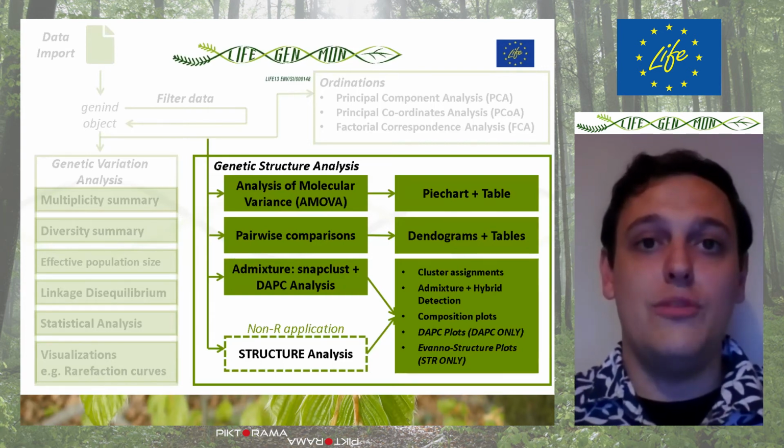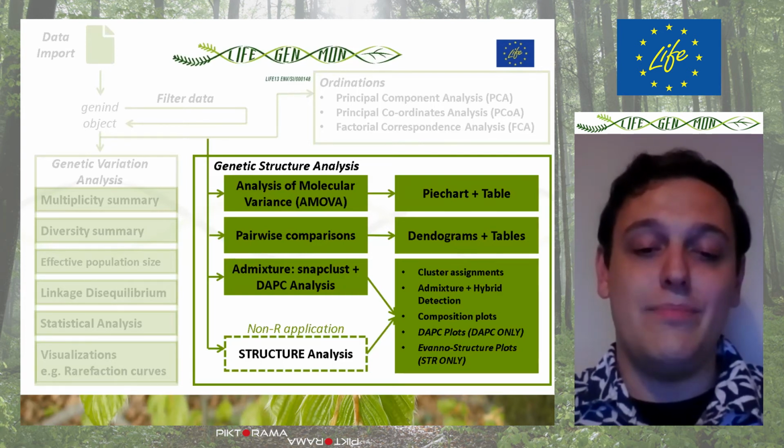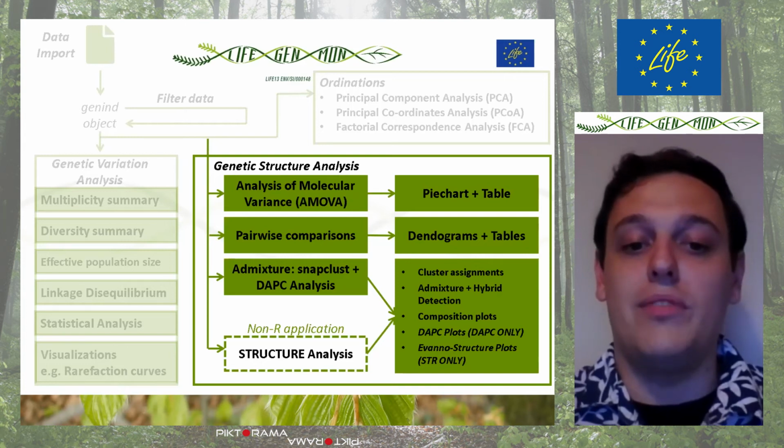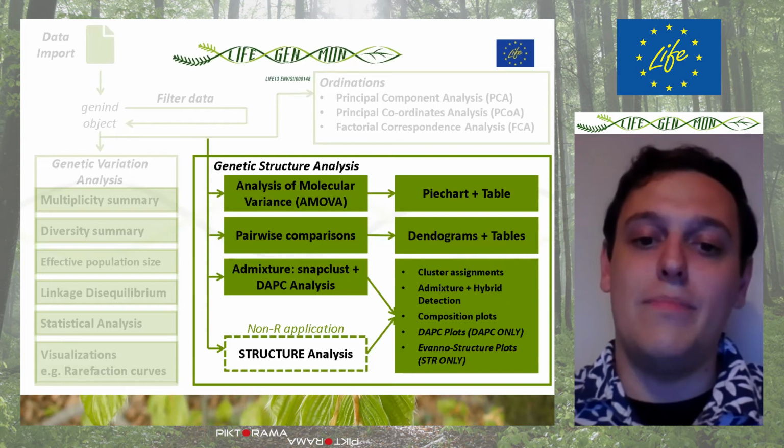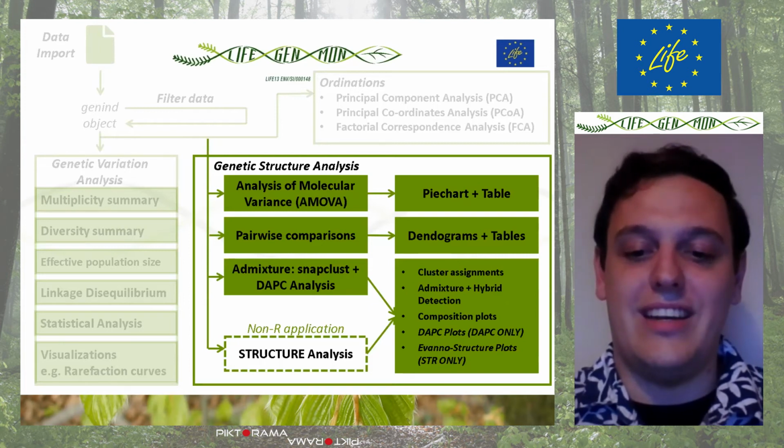We also utilize two methods to determine population admixture and hybridization, along with the optimum expected number of genetic clusters through STRUCTURE and a mix of Snapclust and DAPC analysis.